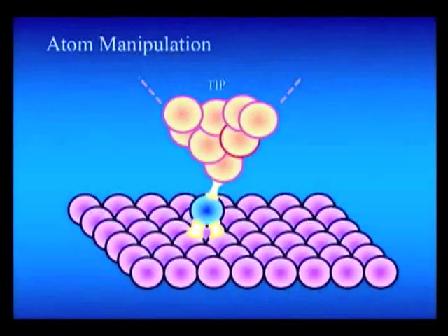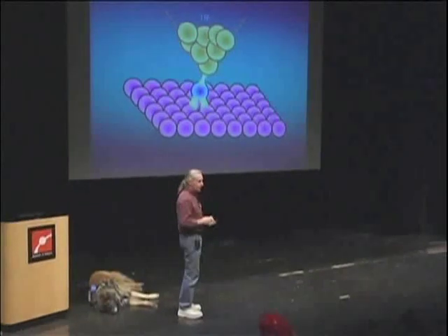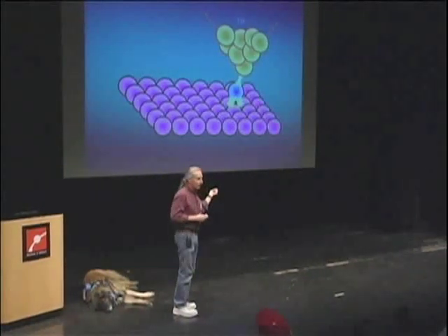Right? So that's actually really important, because that's how we use the microscope to manipulate atoms on a surface. What we do is we bring the tip down so close that this atom on the end of the tip begins to stick to this atom on the surface. And when that's the case, if we then take the tip of the microscope and we move it sideways, guess what's going to happen? It's going to drag the atom with it and bring the atom to a new location.